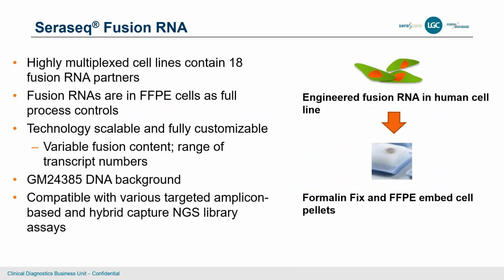Switching gears now from DNA to RNA. So think about it, with RNA, obviously these are longer constructs, right? So we've come up with a very innovative method to synthesize these RNA, right? We make them in DNA, we transcribe them into RNA, and we're actually able to engineer them. We're able to transfect them into that GM cell line we talked about, in different copies.